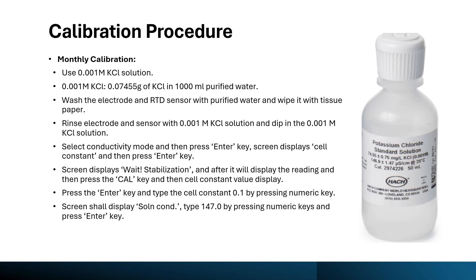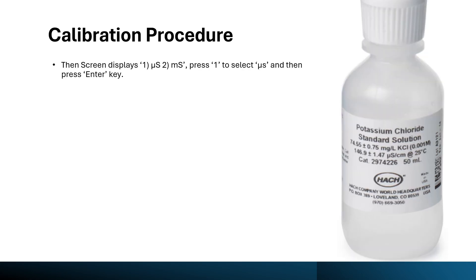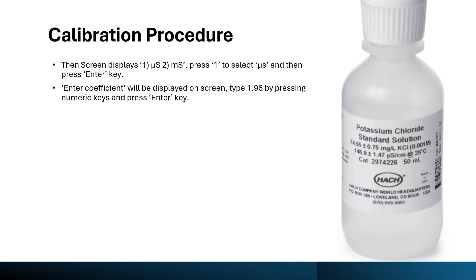The screen will then display solution conditioning — here you need to type 147.0 and press the enter key. Once you press enter, the screen will display two options: option one is microsiemens. Select option one, microsiemens, and press the enter key. Once you press enter, the enter coefficient option will be displayed on screen — type the value 1.96 and press the enter key.